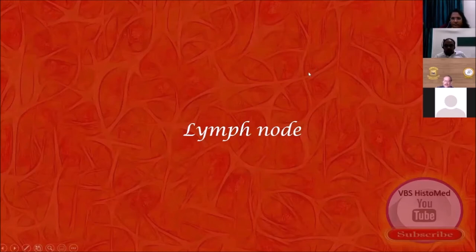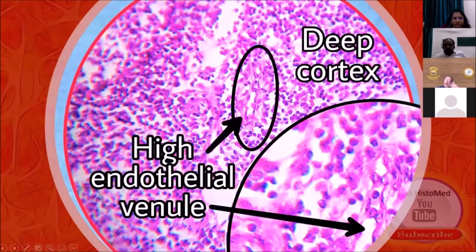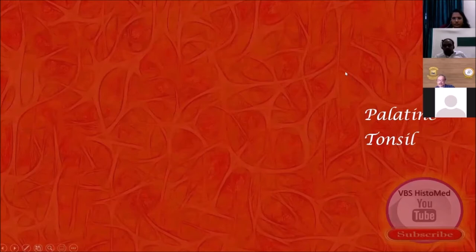This lymph node is a transition slide. Among the commonly missed items in live microscopy in a routine H&E class is this particular structure in the deep cortex — it is called the high endothelial venule. When I checked this in the literature, it has a certain amount of selective permeability to certain cell types, hence it has a lot of clinical significance.